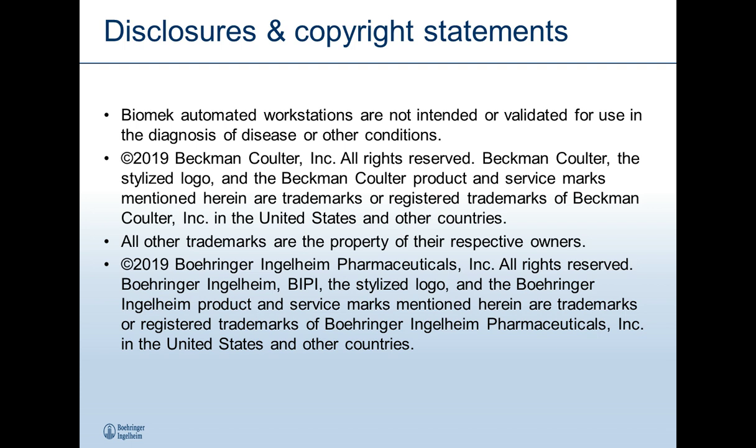Our next question is two parts. Based on your experience, how easy was it to program an ELISA on the Biomek? And what advice or recommendations do you have for an automation novice? In my personal experience, it's actually quite easy to program an ELISA protocol onto a Biomek. Assuming that you're working with a Biomek as a standalone liquid handler, it's basically just a series of single reagent transfer steps.